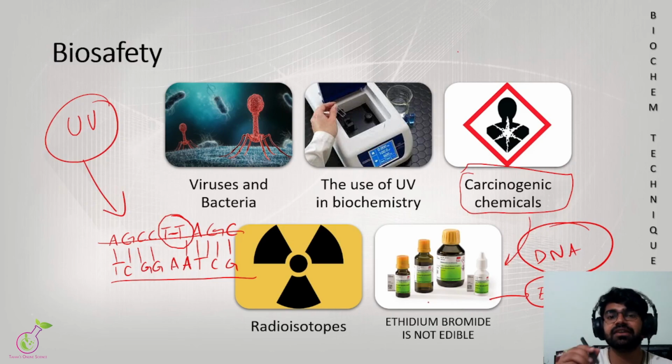Even its fumes can be very harmful to our body when we open the bottle, if the fumes go into our nose. So in that case, what we do is we use masks and we hold the bottle very far away from our nose so that the fumes don't go inside, right?